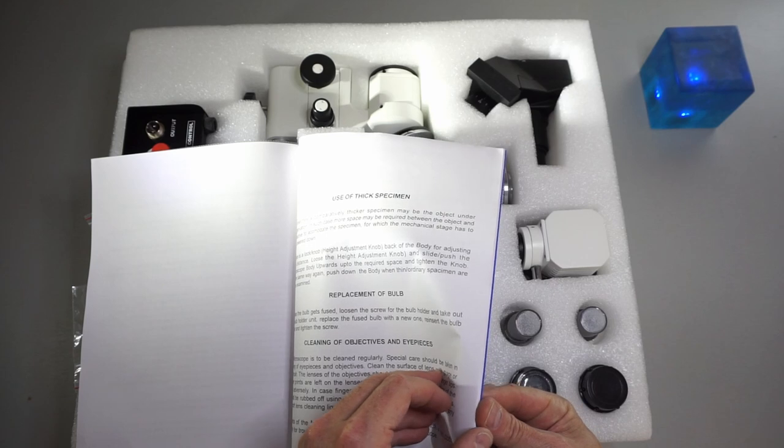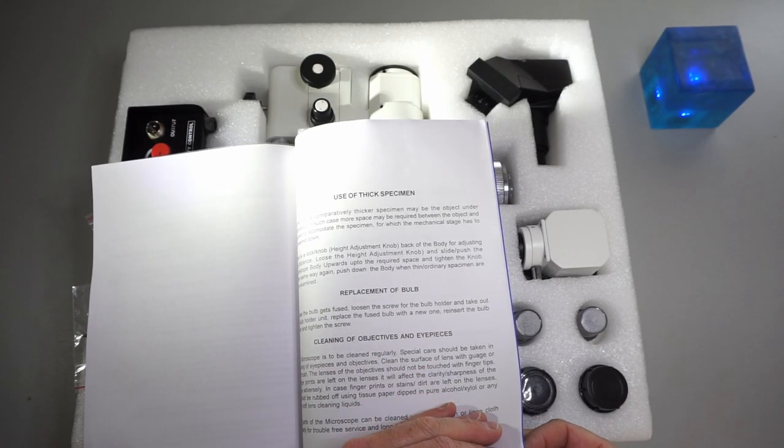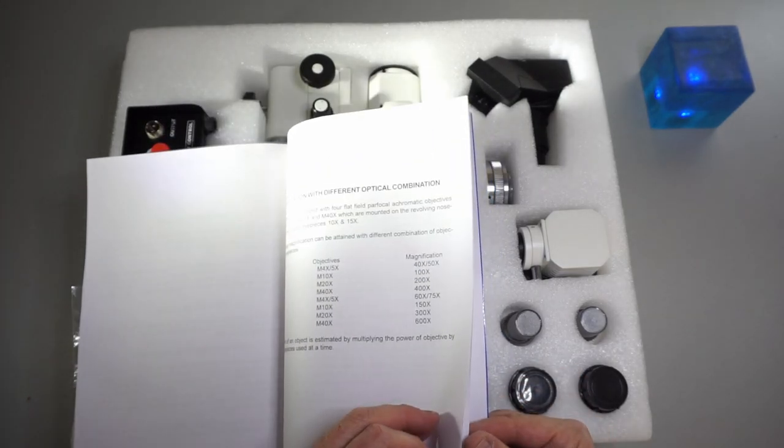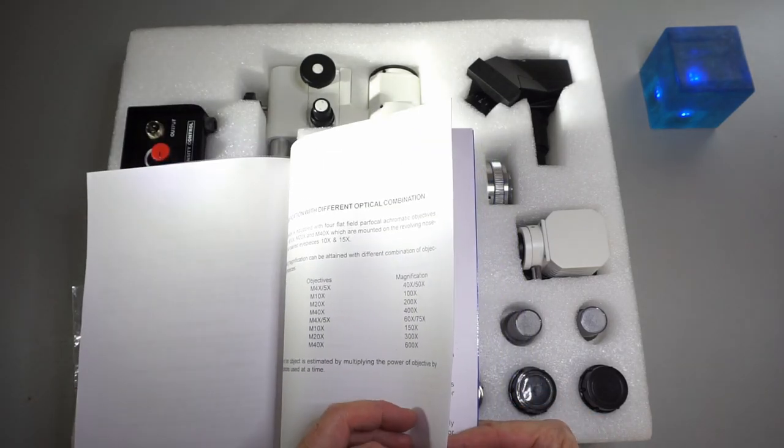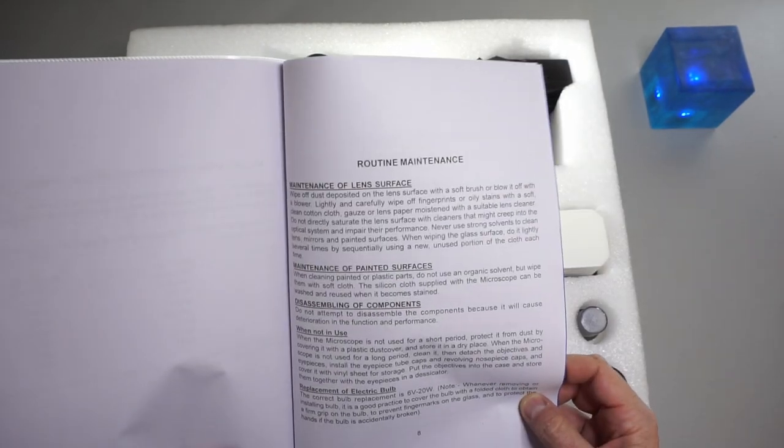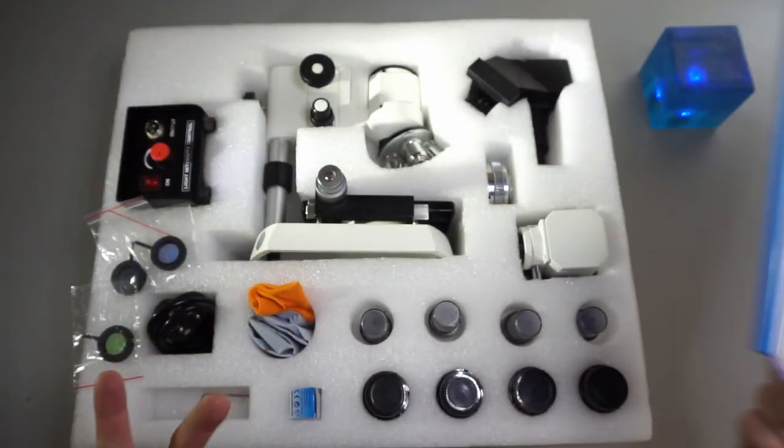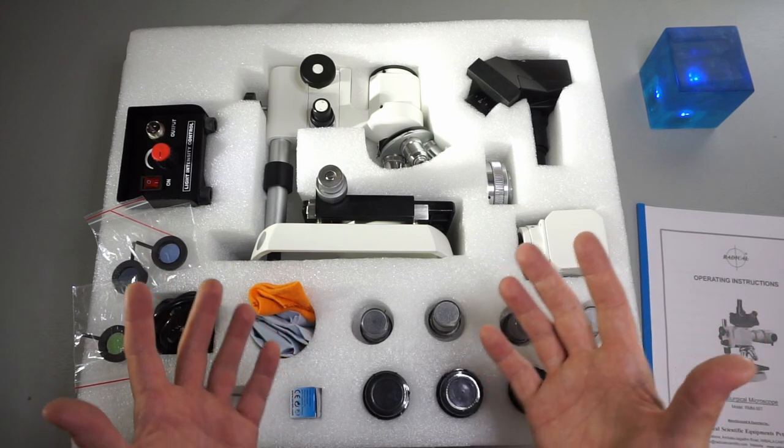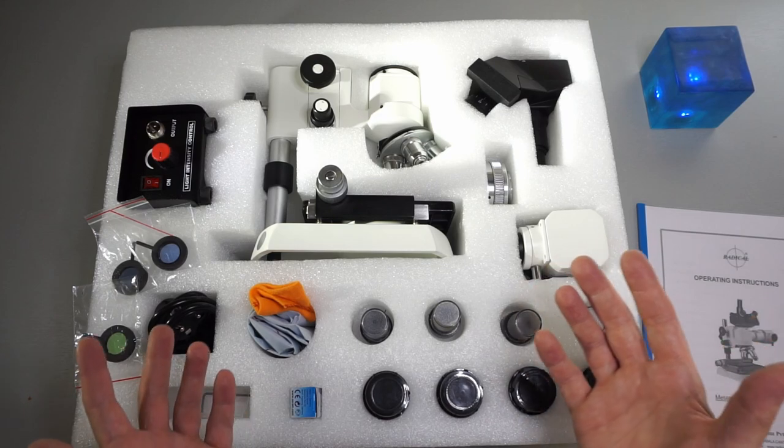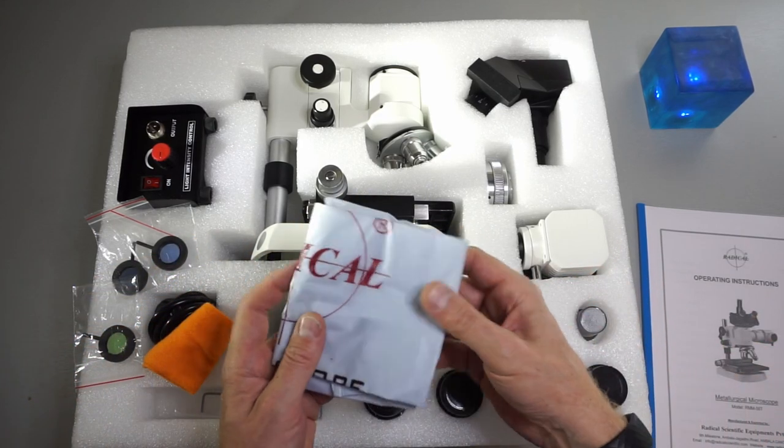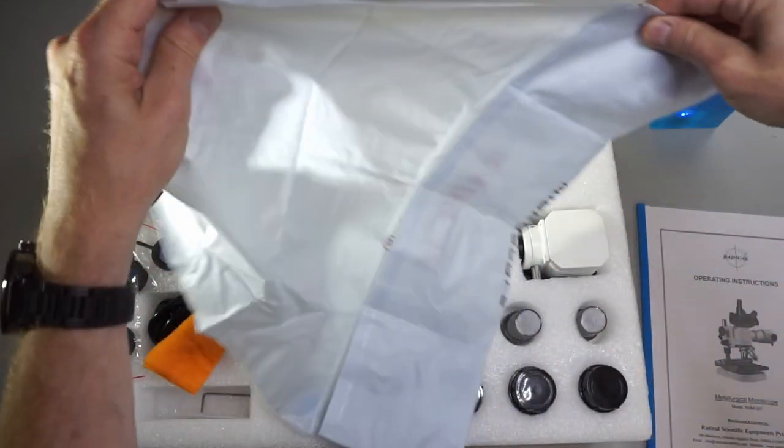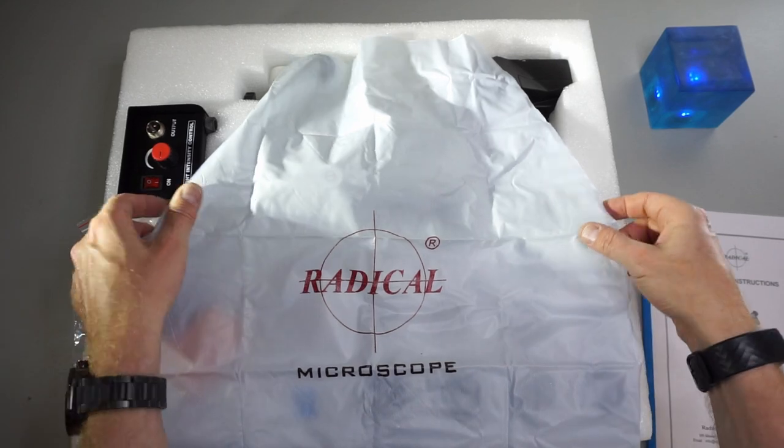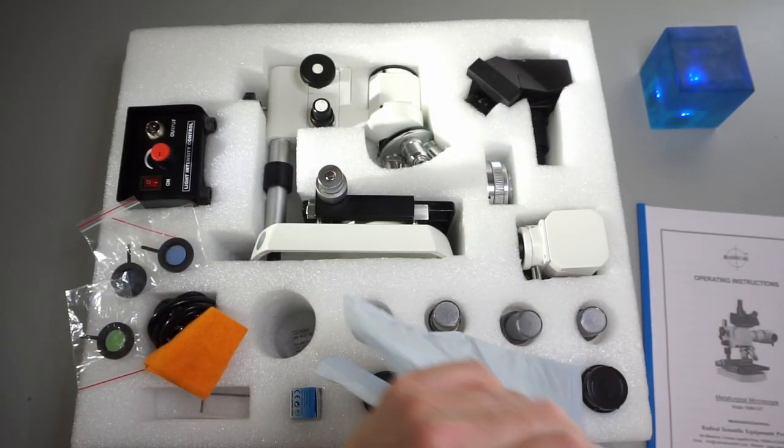Parts layout is there, certain things I have to read before I start assembling the microscope. Some instructions how to change certain spare parts like the bulb, and some explanations about magnifications. This is a rather lean manual but better than nothing. As I said, this is a very cheap microscope, half the price or even a third the price that I have seen from more renowned companies in the US and Europe. But I knew what I would get and so far it looks good.